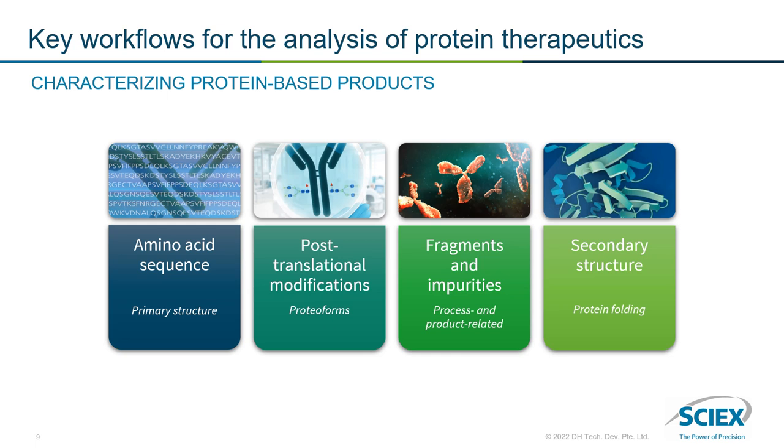Now, throughout the various workflows, we're going to focus on three tools that can be utilized to help you come to a conclusion for your problem. Those tools are accurate mass spectrometry coupled to an LC, or liquid chromatography, so we'll refer to it as LC-MS, followed by capillary electrophoresis and microfluidic modulation spectroscopy.